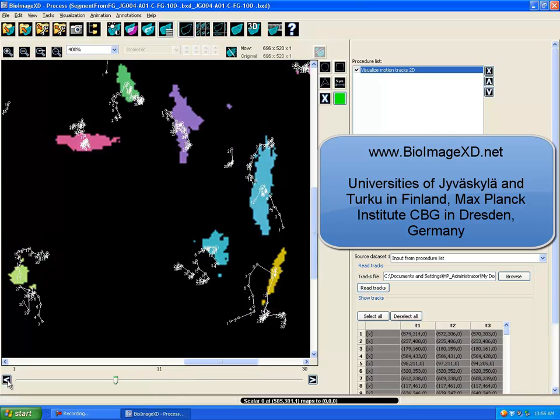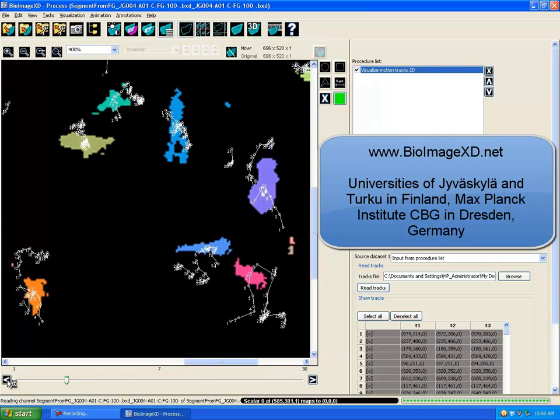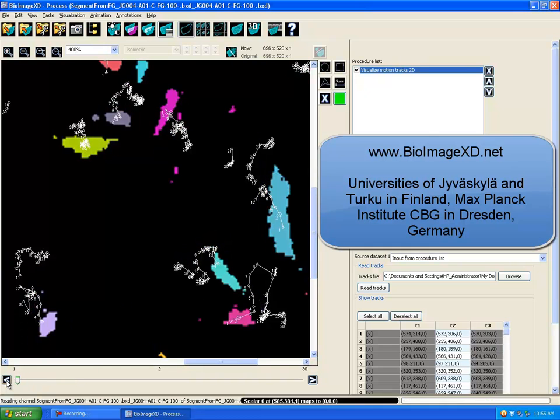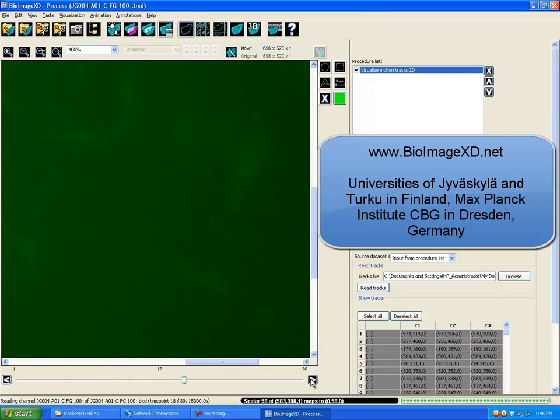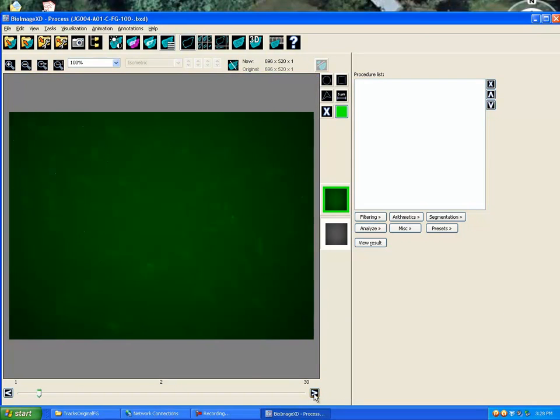I'm going to walk you through the final stages of this experiment, whose purpose was to compare migration rates of GFP expressing cells treated with different types of conditioned medium. This is what the original images look like, with low signal to noise and high dome-shaped background fluorescence.